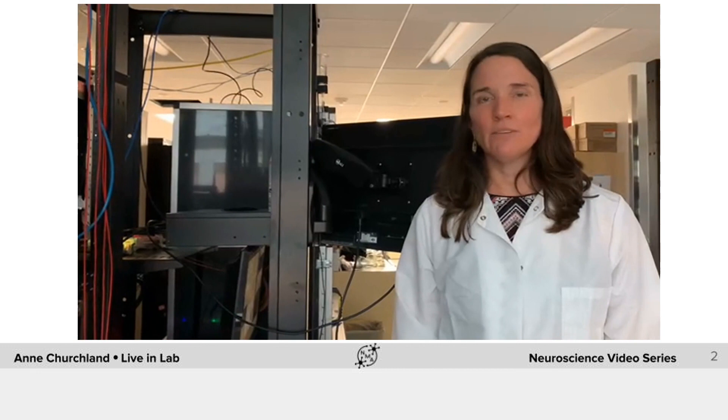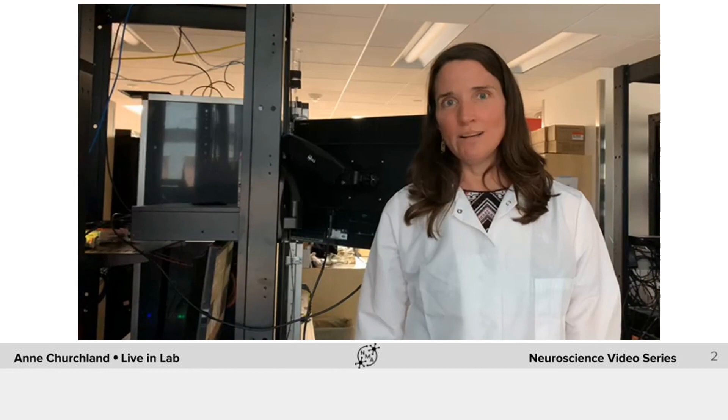Great. Well, thanks a lot, Joao. It was really great to hear about your wide-field imaging setup and how the light path works, allowing you to collect neural signals from the brain. We're really enthusiastic about wide-field imaging because it's pretty high throughput and it allows us to sample the whole dorsal cortex of the mouse, which means we can look at neural activity really broadly. So I hope you found this interesting. And if you would like to analyze some wide-field data, we've made lots of our data freely available online and there's more data out there also. And you might discover something in the data that we didn't even know was there. So good luck, Neuromatch Academy. Have a great time. And I hope you learned a lot in this video about wide-field imaging.